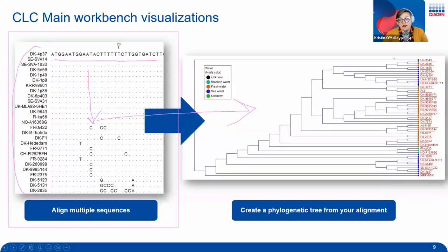Once we've created this tree, we'll actually be able to overlay some metadata information to have a look at not only the lineage of all of these different bugs, or sequences from these bugs that we have collected in our samples, but maybe also identifying metadata characteristics. Like for instance, these seem to be definitely sorting by what type of water they were collected in. So I'll show you how to do that, and again, color and manipulate that phylogenetic tree based on some metadata here.